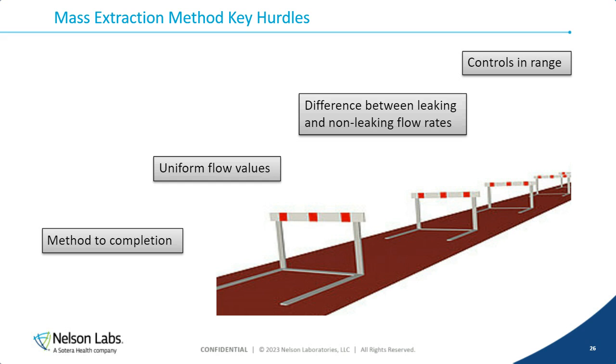Obviously, if I have a high flow value for a solid piece of metal, that means that there's something else in the test system that's causing that high flow. Maybe it's residual mass from the air in the chamber because I didn't get it evacuated out, or maybe I've got something in the test system from the previous sample that's gumming up the works. That's why I need to have that negative.